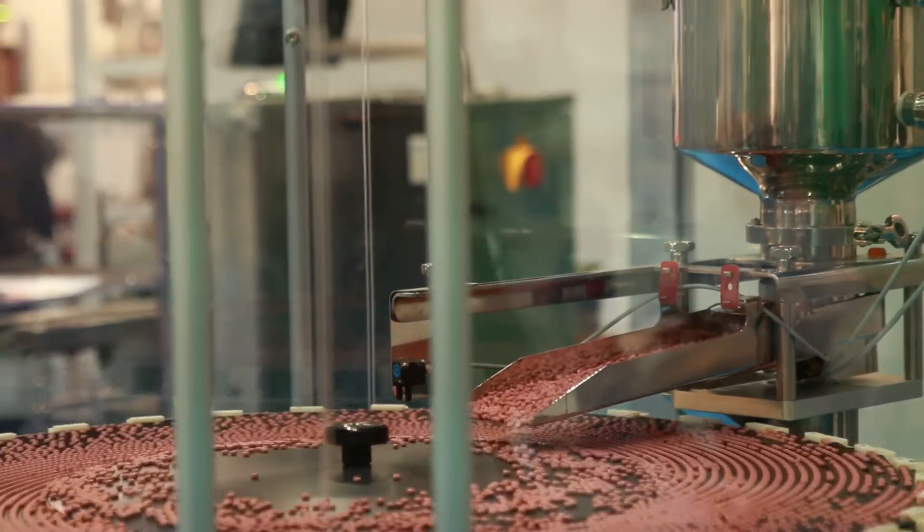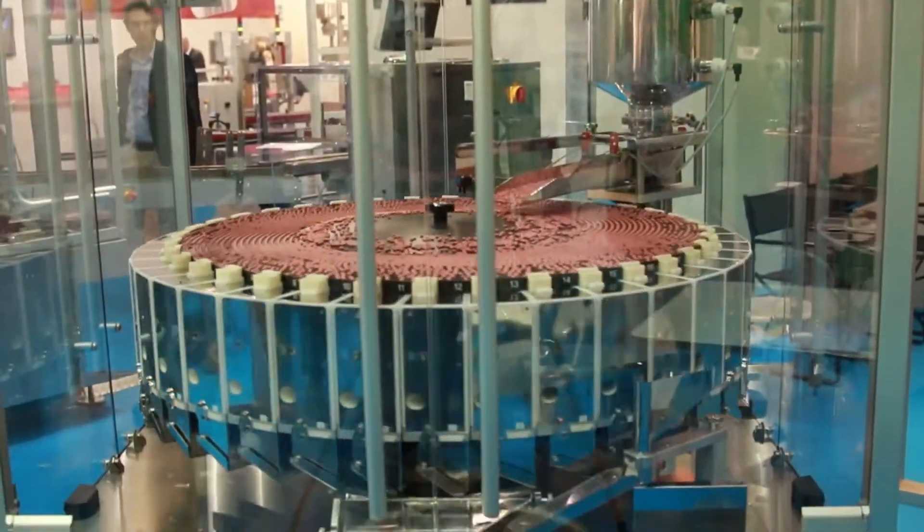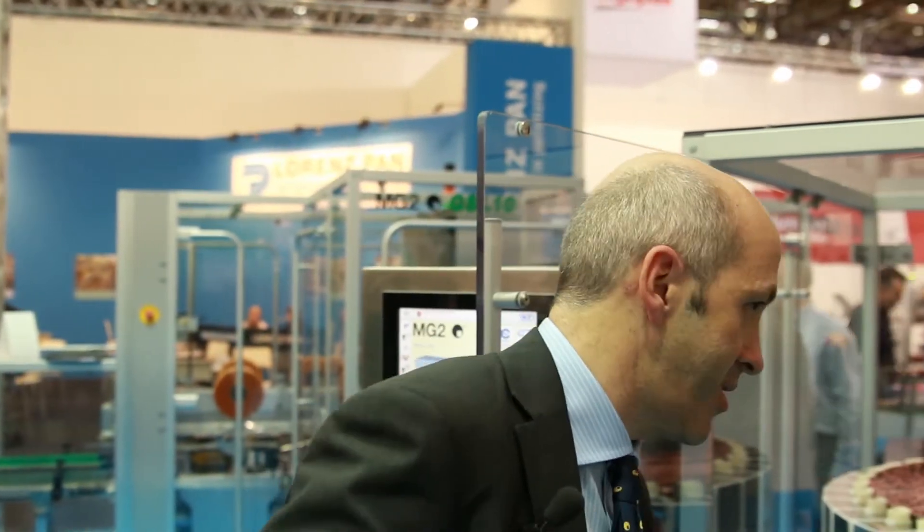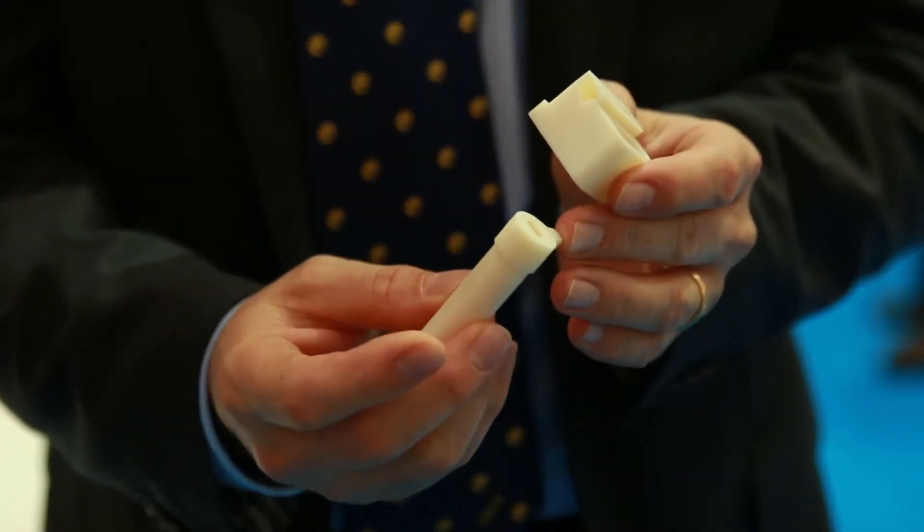We are speaking about 500,000 units per hour and we can check different kinds of tablets. It's just a question of changing some parts — the parts that are size dependent are just two: one is this part that lets the tablets go into the system, and one is this one that lets the tablet go through this module, which is the weighing module of the machine.